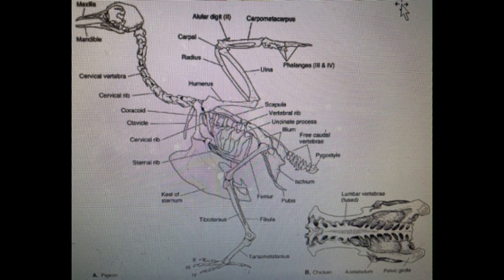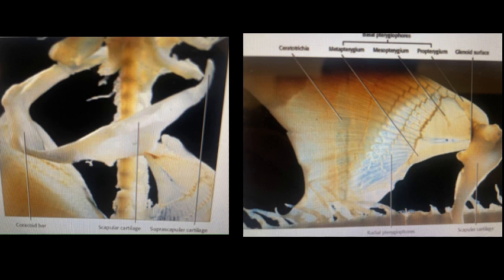The next part talks about the pectoral girdle and fin elements of a shark. The pectoral girdle, consisting of a U-shaped complex often called the scapulocoracoid bar, lies just posterior to the last gill slit, and the ventral portion of the U is the coracoid bar.